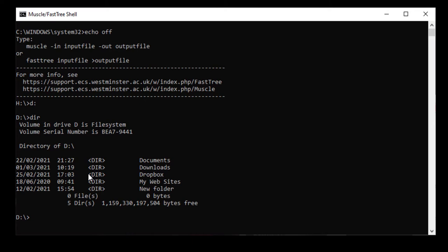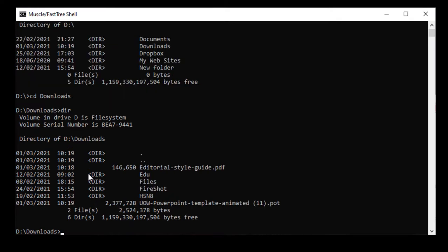And next I move into the Downloads directory using the CD, the Change Directory command. So I type CD Downloads. If I do DIR again, then I find there's a PDF file and some folders called Fireshot as well as H5N8. So I can now move into the H5N8 directory with the command CD H5N8.